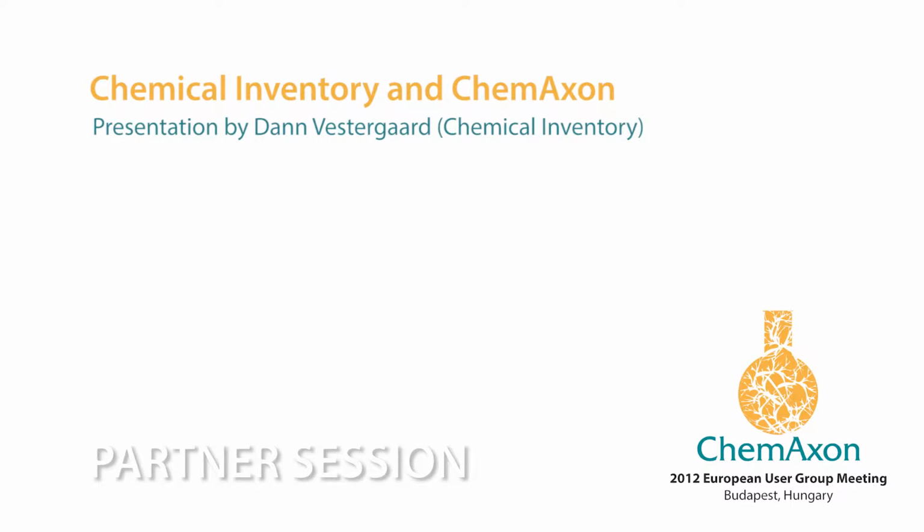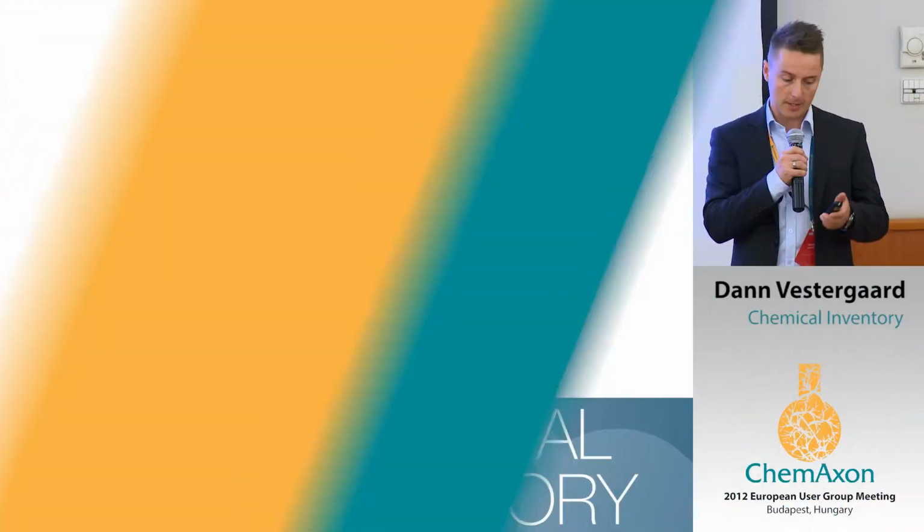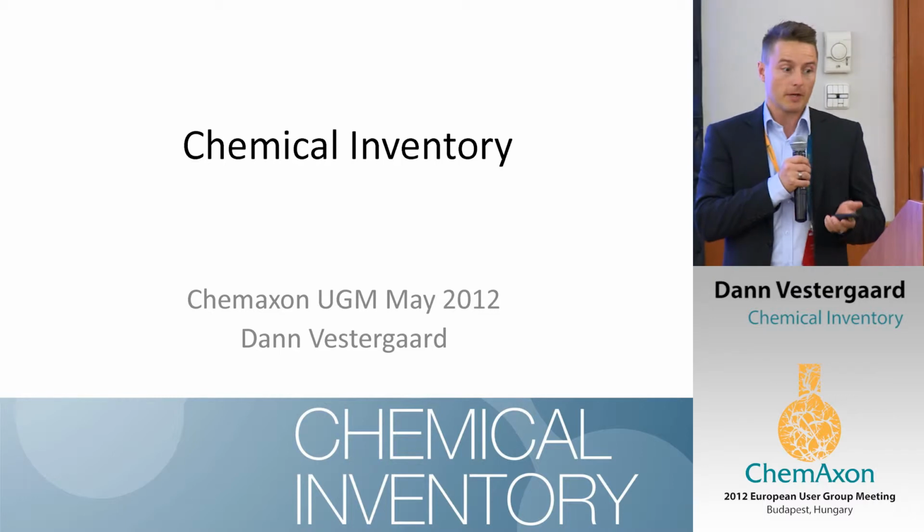Vestergaard from Chemicalinventory.org. Hi, as stated, my name is Dann Vestergaard. I'm representing Chemicalinventory, which is a full inventory management system.